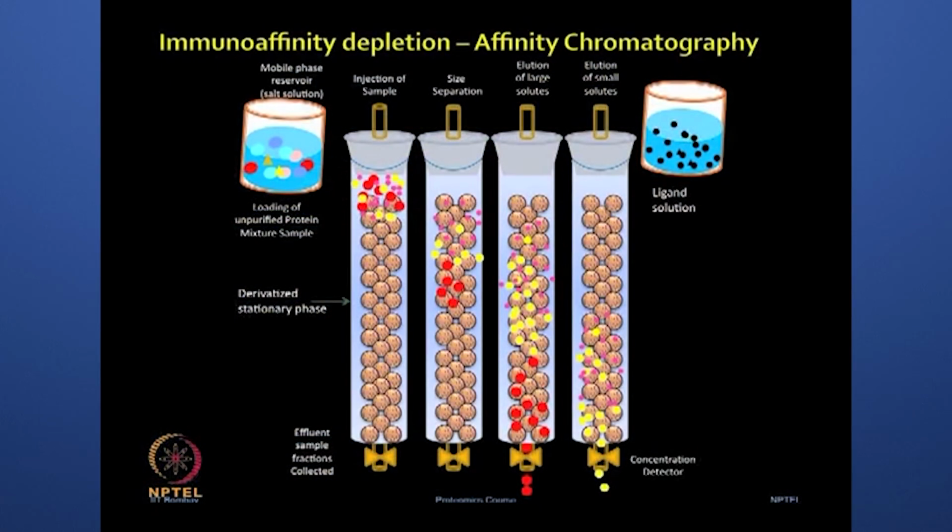As you are aware, and in fact we have discussed the protein preparation from serum earlier, each biological sample poses a lot of technical challenges, and serum is one among them, where the presence of highly abundant proteins such as albumin and immunoglobulin results in the masking of low abundant proteins.